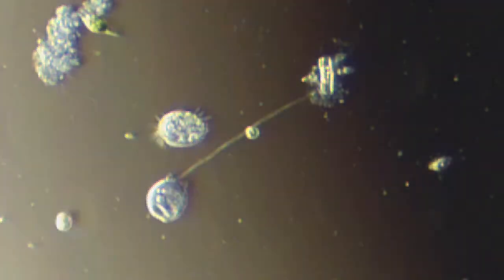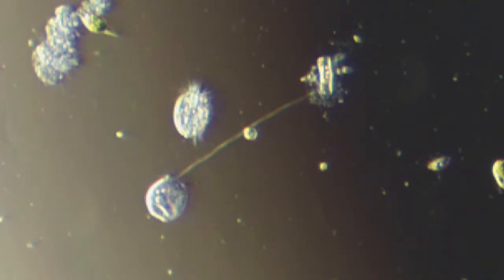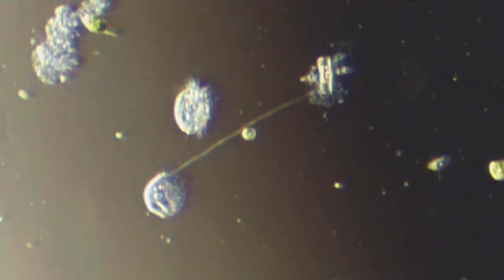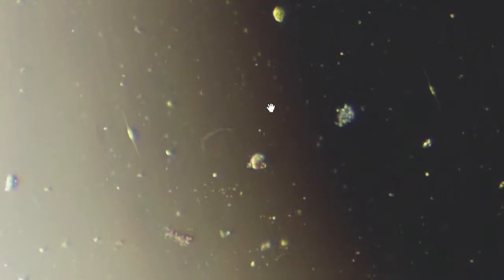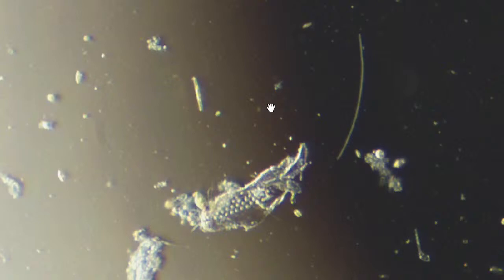Here's a Euglena again coming through. We bumped off that guy. There's more little guys swimming through. So you see the spiky stuff? Whether it's swimming or just sitting there pumping away, all these guys are bumping into them. So let me back off. There's Euglena on the right side again. Back off a little bit and do a little more searching before the slide dries up. There's some nice debris of something that broke down.